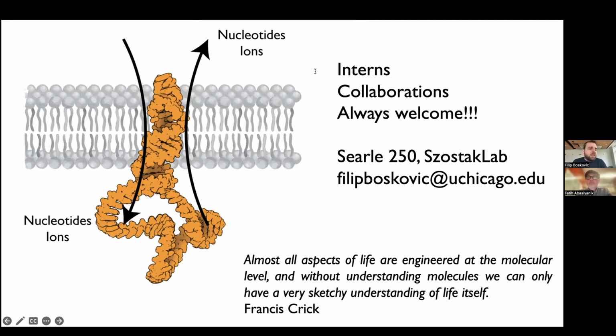So one good thing is to have a good initial sample. If you don't care about short DNA sequencing, but you more do, I'm not sure what exactly you do, that might also help with the answer, that you just purify your DNA a bit more. And in that sense, you should get higher pore activity.